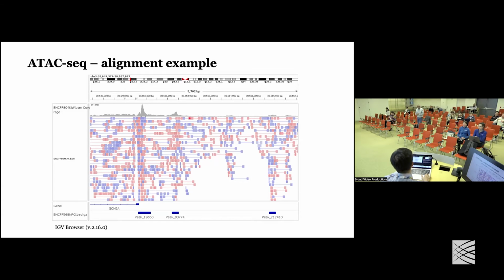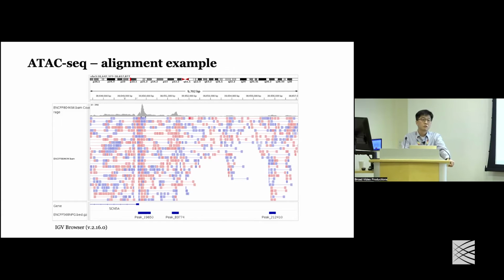I think it's more about the biology. If the regions are broadly open, then correspondingly the width of the peak should also be broader. The peak calling algorithms also try to capture those aspects when they call peaks. Taking MACS2 as an example, which I think is the most common one. Yes, I use that all the time.